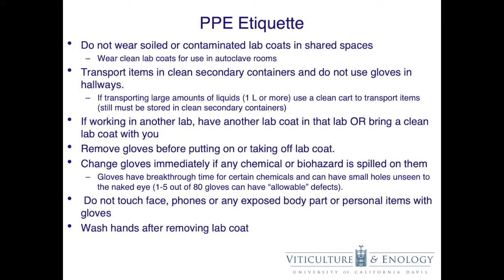Do not touch your face, phone, headphones, or any exposed body part with gloves. Doing so can contaminate your skin or personal items with any of the hazards you have on your gloves. Wash your hands after you remove your lab coat. The idea is that your lab coat is contaminated, so once you touch it, your hands are then contaminated. Washing your hands after removing your lab coat removes any hazard that was on your lab coat from your hands.